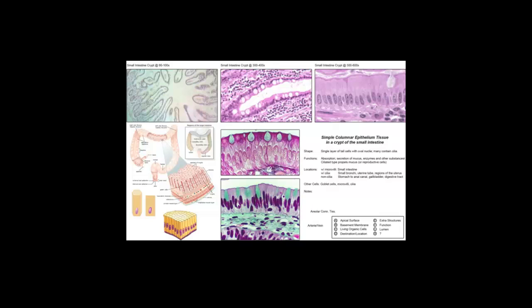That's also seen here in one that's laid down sideways. This is a lacteal as well. Okay, so these cells that we're looking at, to reiterate, are columnar. Their primary function is absorption, and the line of microvilli, or the brush border on their apical surface, enhances thousands of times the ability of these cells to absorb the nutrients from the food we've eaten.